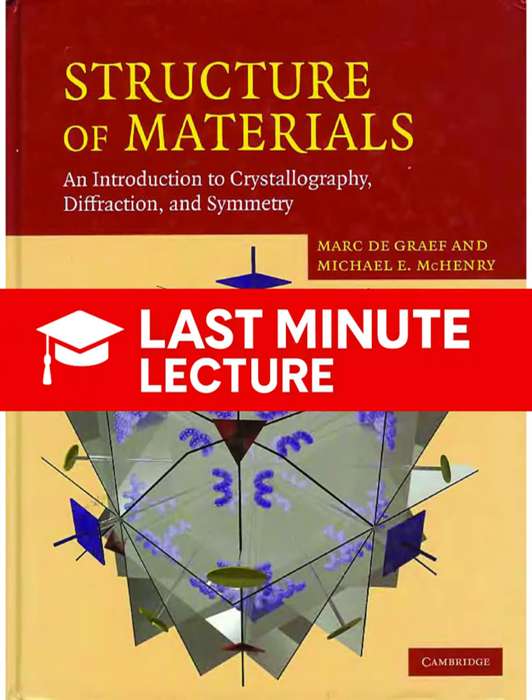Okay, we've established the theory. Diffraction happens when a reciprocal lattice point intersects the Ewald sphere. Now, how do we force that intersection to happen in the lab? There are two primary strategies. Strategy 1, keep the incident beam and the Ewald sphere stationary and mechanically rotate the crystal and its reciprocal lattice until a point sweeps across the sphere surface. And strategy 2, keep the crystal stationary and adjust the X-ray beam itself, which effectively means rotating or changing the size of the Ewald sphere until it intersects a stationary lattice point. And the main experimental methods are all based on one of these two strategies.